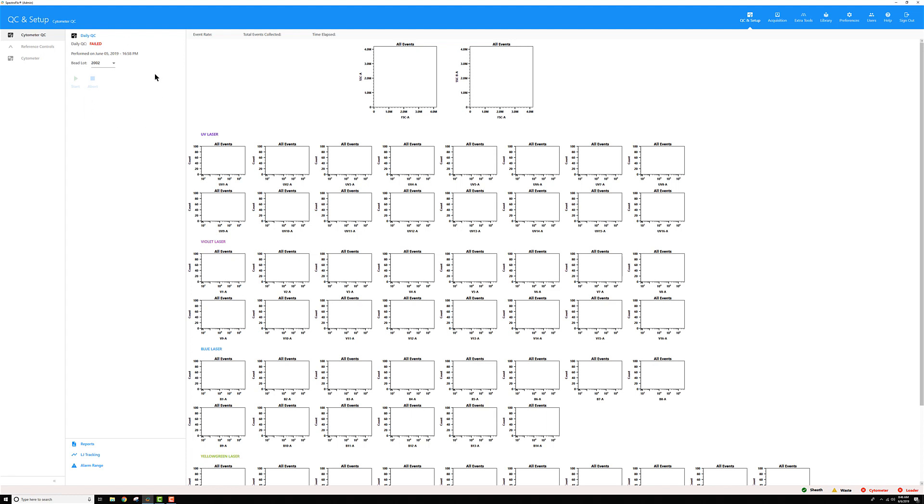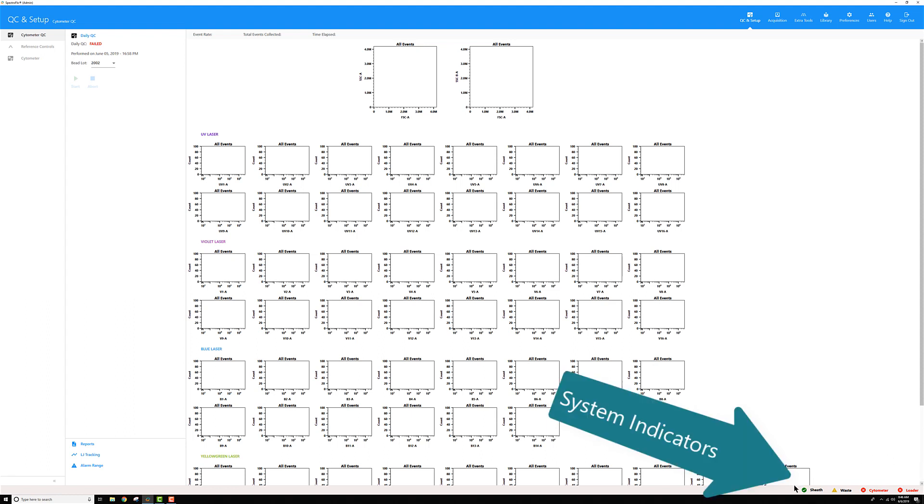And finally, that one feeds over to this pane on the far right, which is where the majority of the content is displayed. So for here, I'm in cytometer QC. I'm looking at my daily QC. My instrument is currently turned off, and how do I know this? I can look at this bottom right section here where there's a series of indicators.